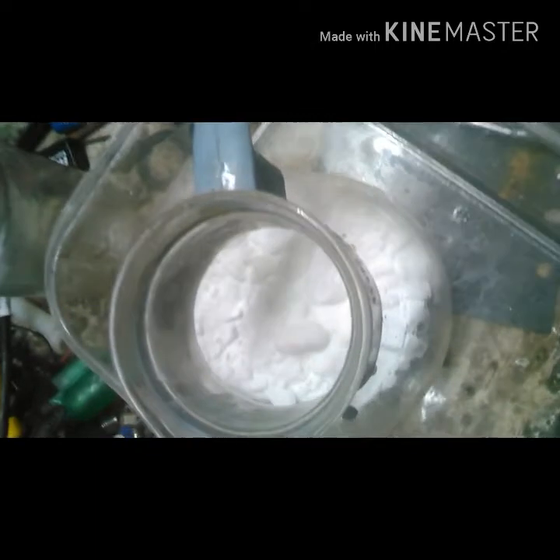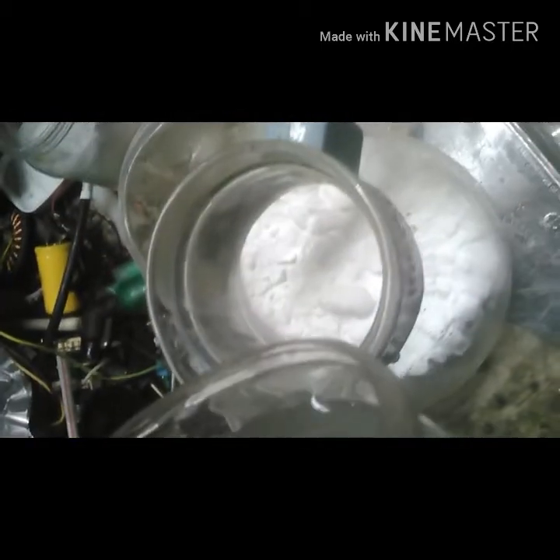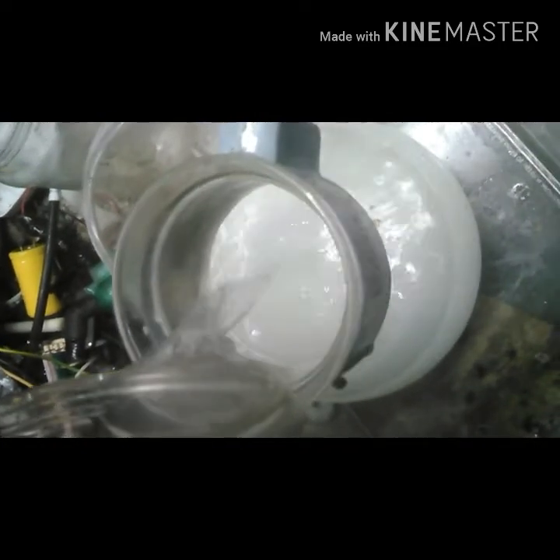Now I'm all filtered. I'm going to add this liquid to a heat vessel that can take heat, and it has the same amount of baking soda in it, which is 170 grams. I'm going to pour this in here and then stir it up real good. Then I'm going to start heating it up to evaporate the liquid down to about 150 ml.